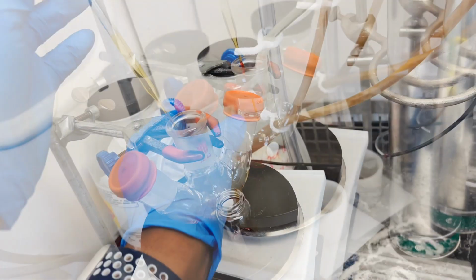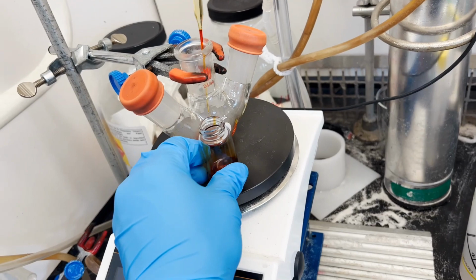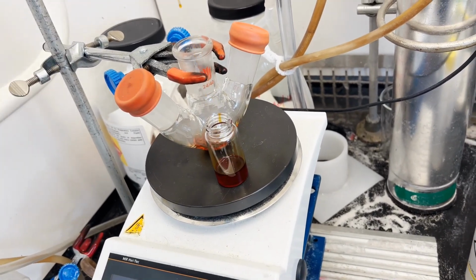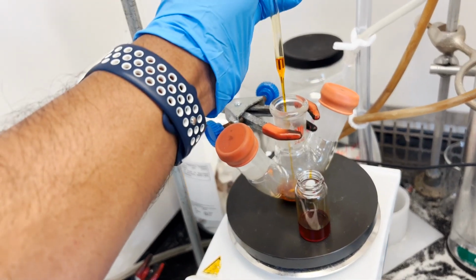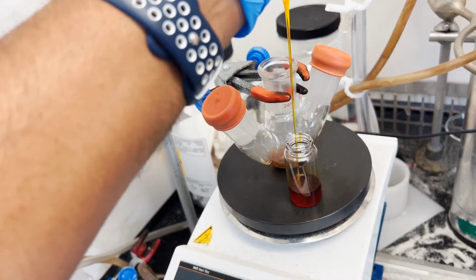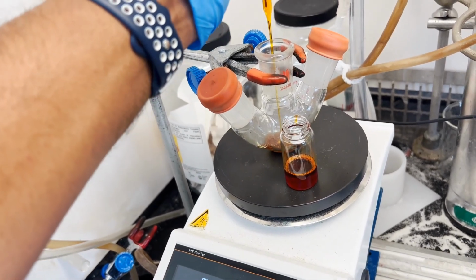After taking all the liquid, you can use the same dry anhydrous solvent again to wash out the remaining part, and then you can use more for rinsing. With the pipette, just transfer that remaining rinsed solution to the same vial, and then you can do the rotovap to remove that solvent.